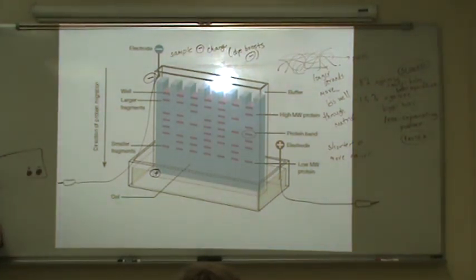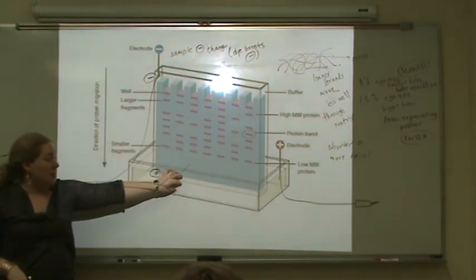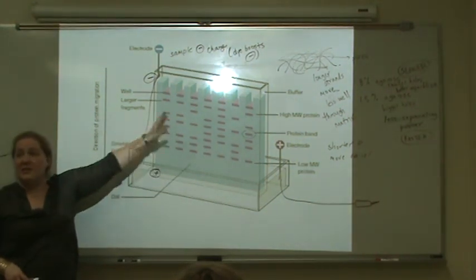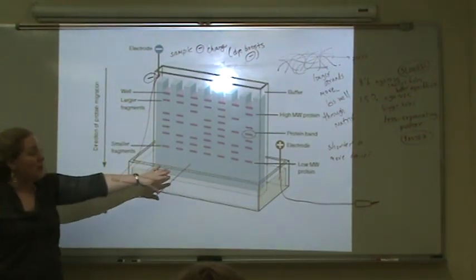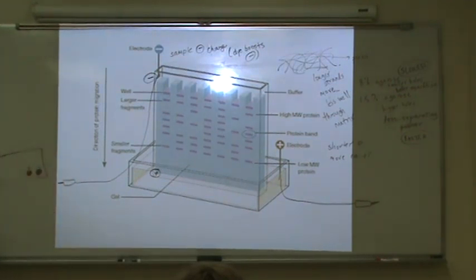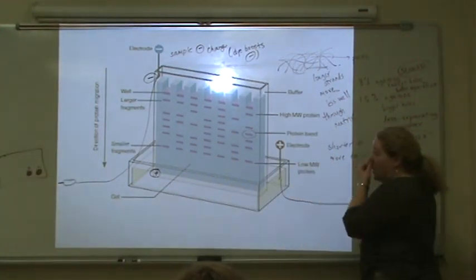Yes, it does. And then the postdoc is kind to you and doesn't yell at you, and he's like, you can do it again tomorrow. The alternative is there are ways to capture what just ran off. It comes out into a buffer. Actually, all of this is immersed in a buffer, either vertically or horizontally. There's ways to capture your stuff out of the buffer, but it's a hassle. So always check that. It's a super simple thing. You'd think they'd make plugs that only fit one way, but no, you're supposed to be smart if you're doing this research. Don't plug the plugs in wrong.